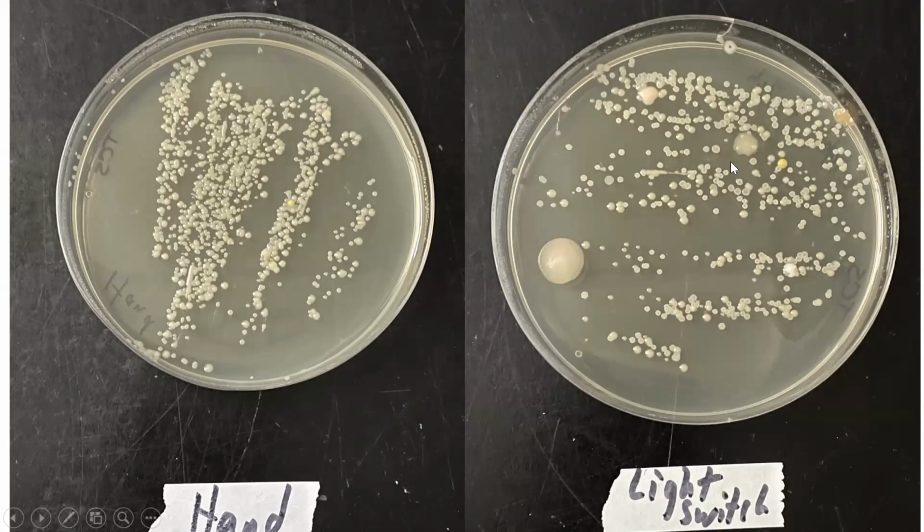And I can tell you just looking at the cultures that most of that is going to be Staphylococcus epidermidis. It's found on everybody's skin. Every hand I've ever swabbed, that's like 99% of the bacteria you get on there. Kind of looking at this, there's maybe one yellowish colony there, so there might be some Staphylococcus aureus there.